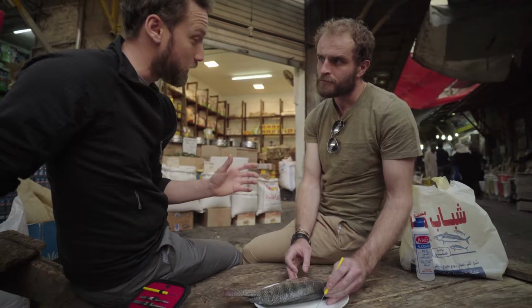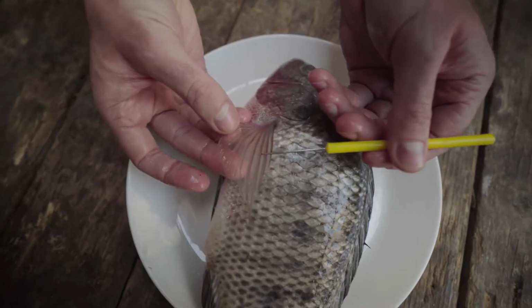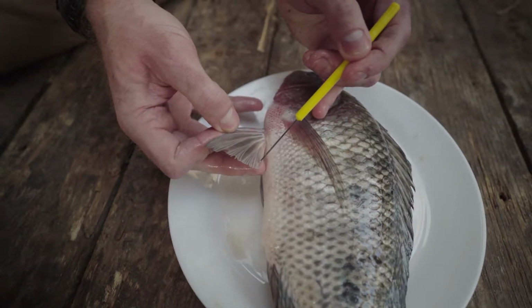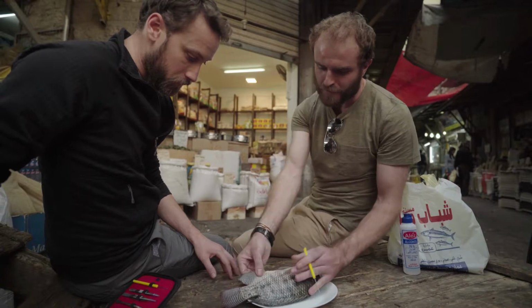So Shane, can you talk me through the fins on this fish? Great, okay, so you've noticed this fish has a lot of fins, right? First of all, right here, this is our pectoral fin, like your pecs are right there. Here we've got our pelvic fin, which is attached to the animal's pelvis right here. We've got our caudal fin down here, that's at the very back of the fish here. We've got our anal fin just here.